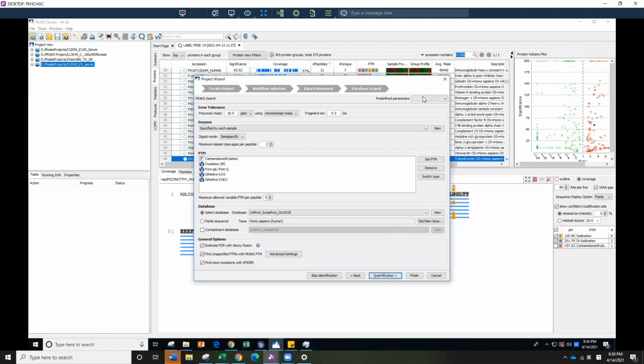Under a lot of normal standards, you go to BYUMS, and then there are our standard runs. The parameters are the same as the cheat sheet next to the computer monitor. Usually we use 20 ppm error tolerance with 0.5 delta. The samples are specified from each sample from the previous step.